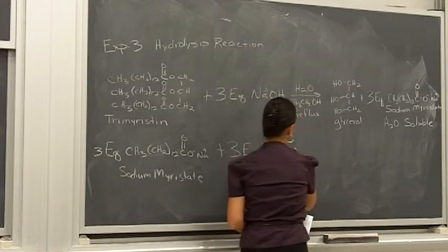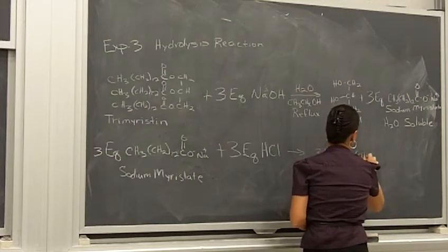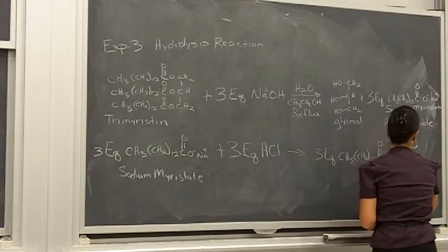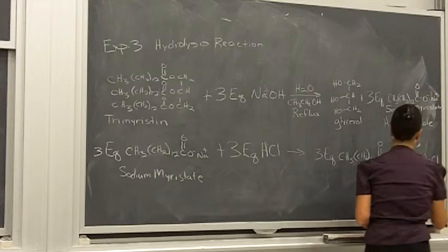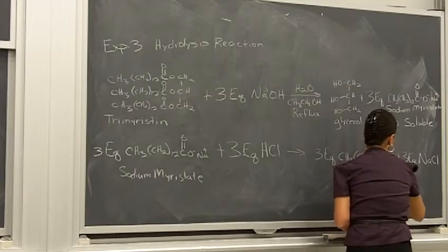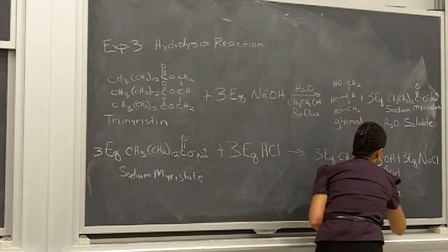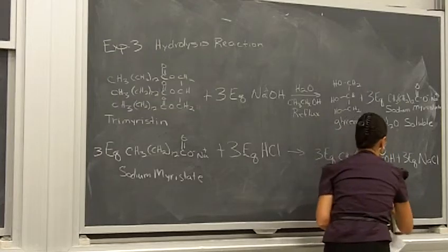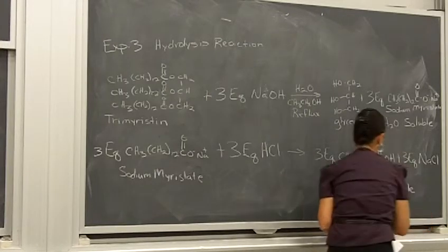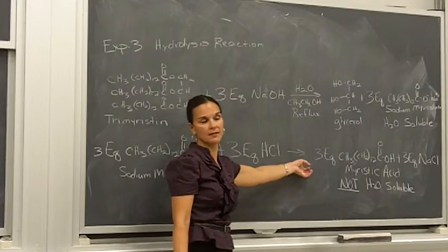We'll add 3 equivalents of HCl, and then we will get our myristic acid out, plus some sodium chloride, okay? And just like when we reformed our benzoic acid, this is not water soluble. So once we add our HCl at the end of our reaction, you will definitely see a solid that you're then going to isolate with vacuum filtration, all right?